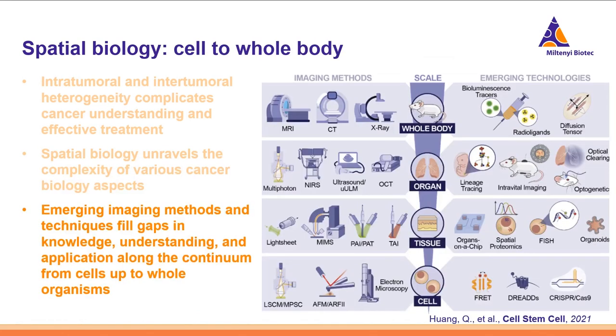And so there have been a lot of different techniques that have arisen to probe the spatial biology aspect. For this particular talk, I'm going to be focusing on those that are emerging in the imaging methods, specifically not only the specific techniques, but also different workflows that have looked at the tissue level, to understand at a tissue level of the tumor microenvironment how these different things come together with that spatial context.